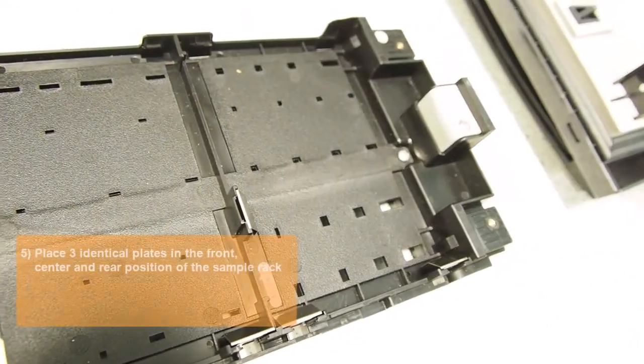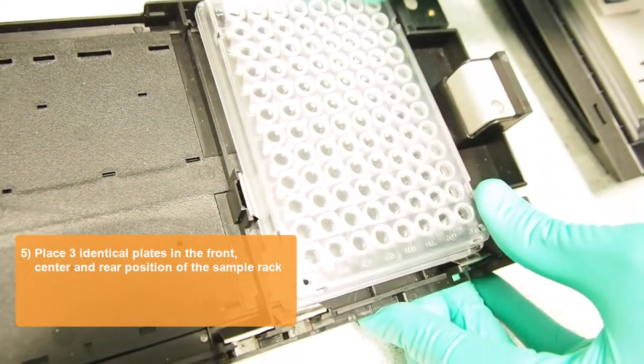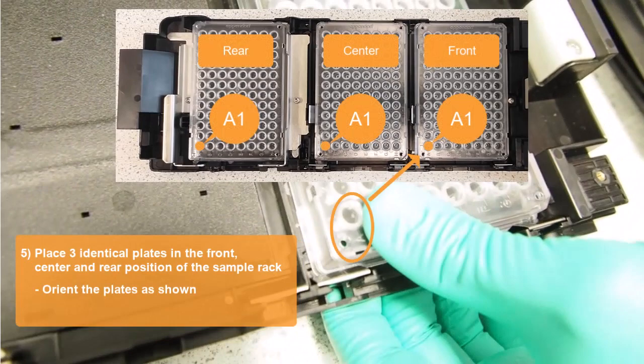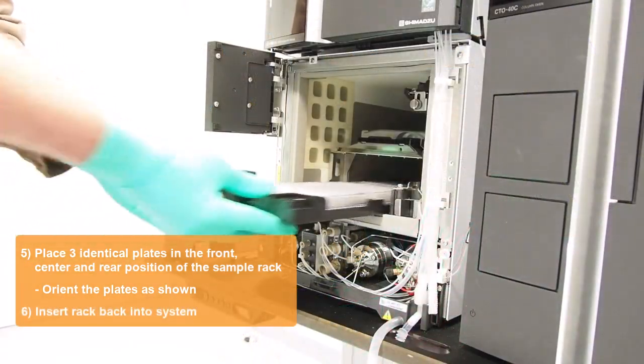Next, place the three plates of the same type that you want to calibrate into the front, center, and rear position of the sample rack. Make sure that their A1 position is oriented as shown. Now insert the sample rack back into the system.